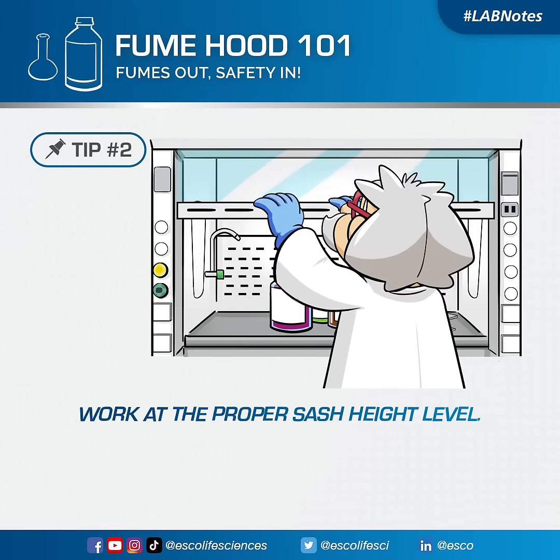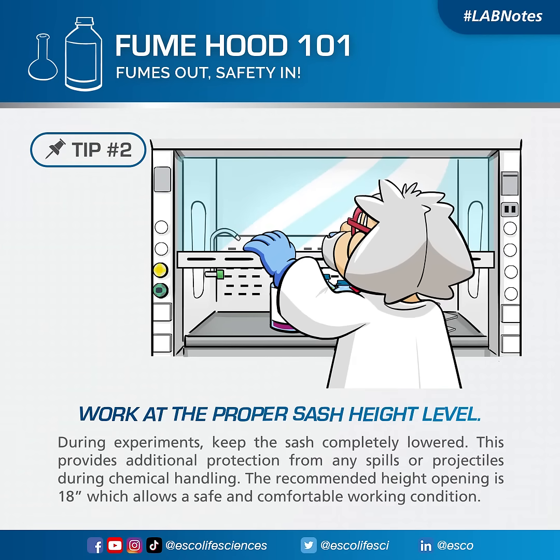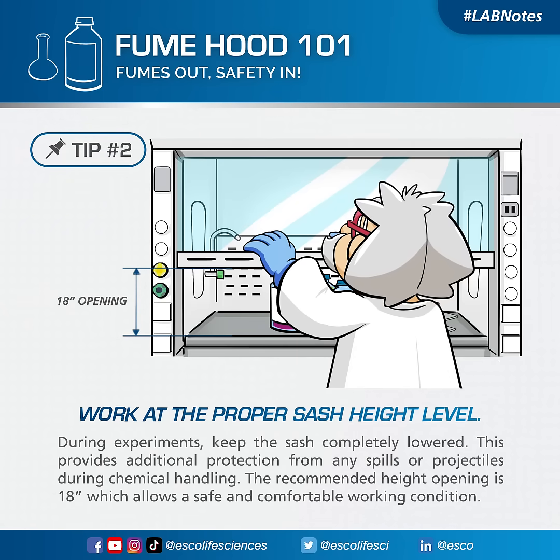Work at the proper sash height level. During experiments, keep the sash completely lowered. This provides additional protection from any spills or projectiles during chemical handling. The recommended height opening is 18 inches, which allows a safe and comfortable working condition.